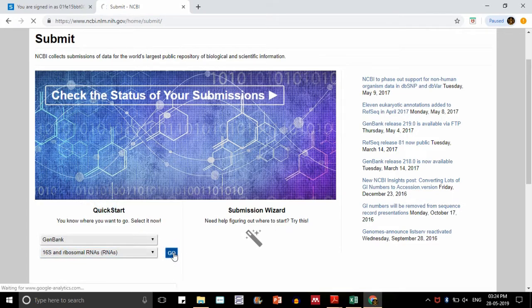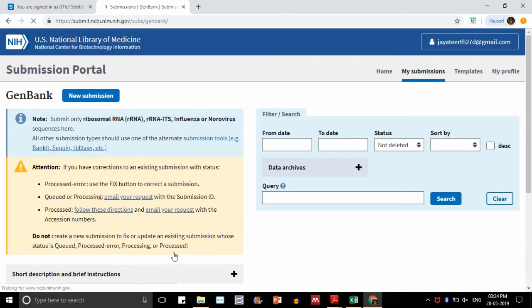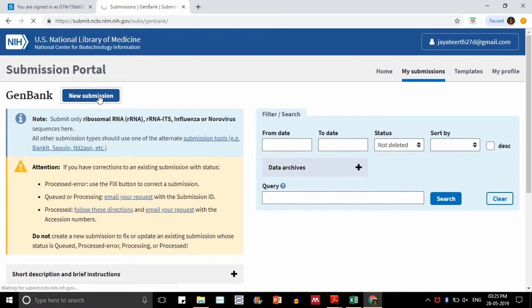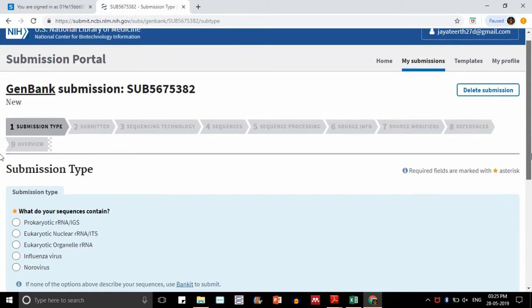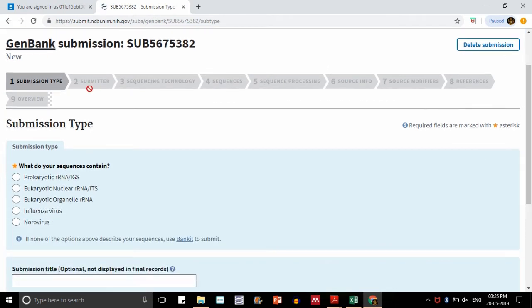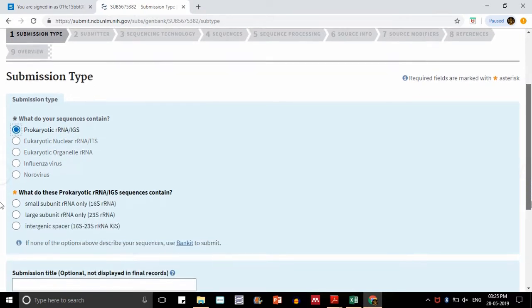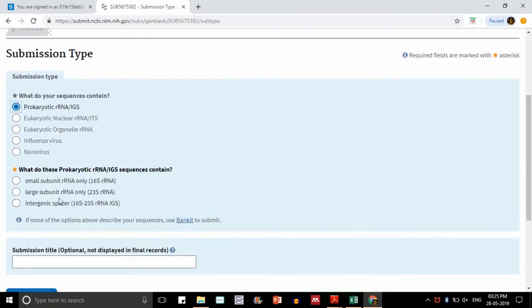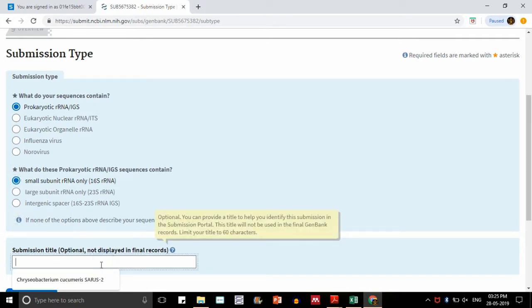We have come to the next page. There is some note we can read: submit only ribosomal RNA sequence or rRNA ITS. I'm clicking on new submission. Here is the new submission GenBank ID that will be required for your queries in future. Submission type is prokaryotic sequence. I am submitting small subunit ribosomal RNA sequence, that is 16S rRNA. Submission title is optional, but I am still giving it a title.